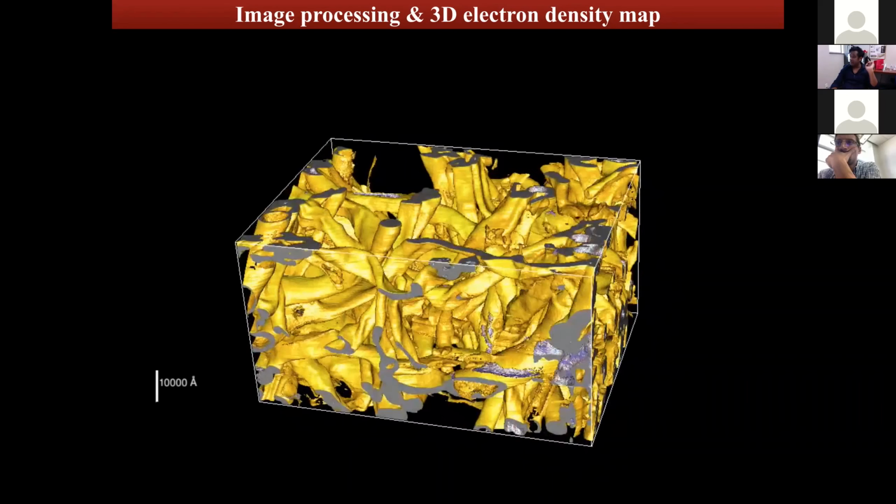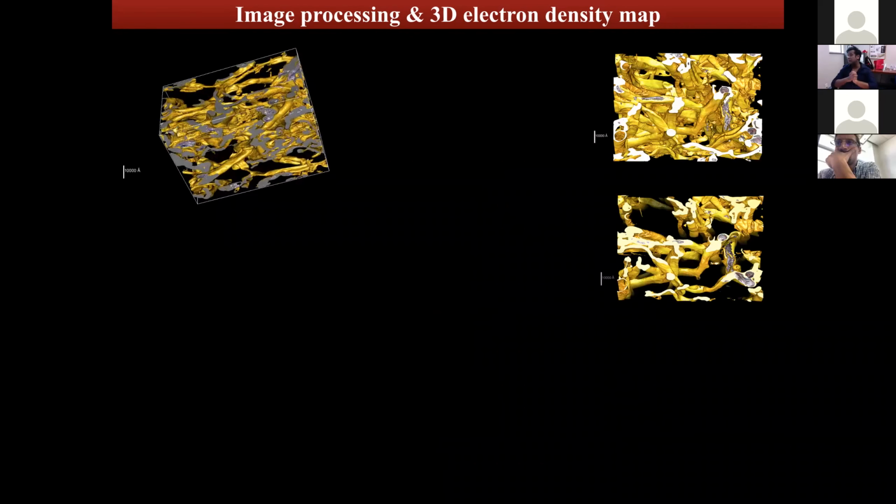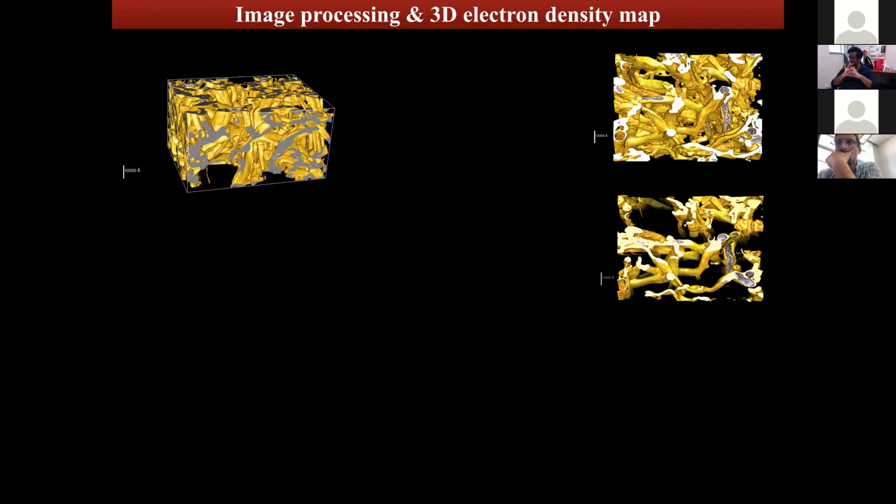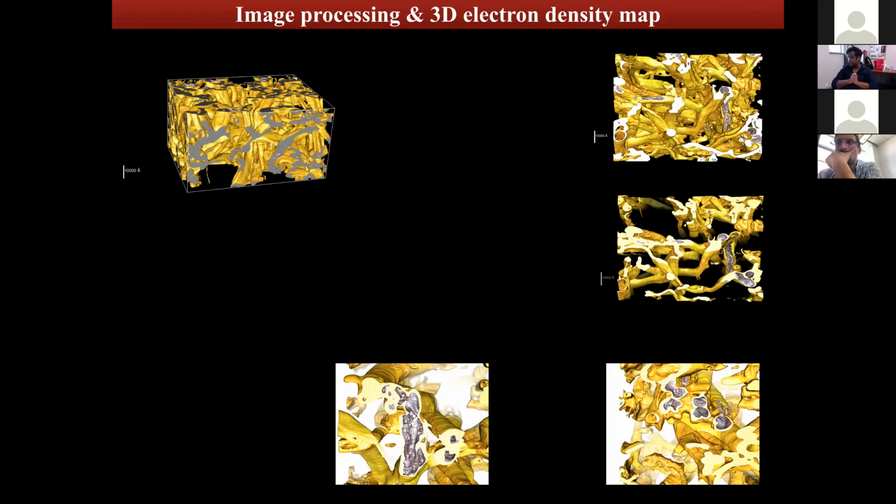And what you can do is select out regions of interest, okay? So the regions of interest can be selected out. You can extract out one single filament and then look inside those cells for the more subcellular details. From this particular data set, what we were able to do is measure the thickness of the cell membrane or the cell wall, and figure out what the variation of that cell membrane is. Is it uniform, or is there something going on when budding or cell division is taking place? So all that information is available to us.